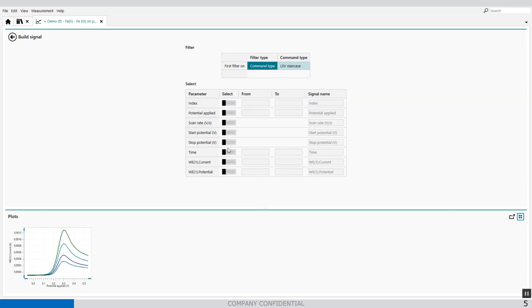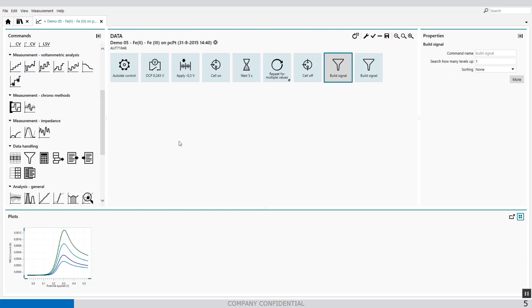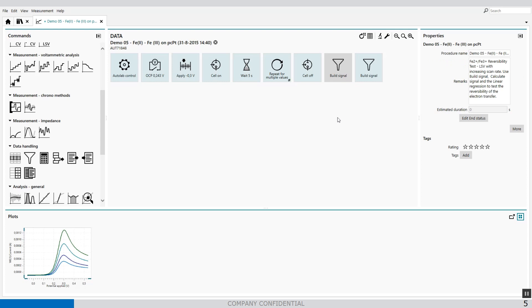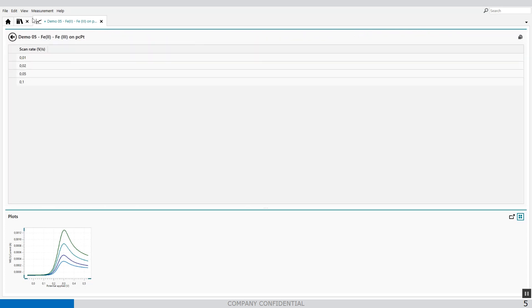We will find the scan rate. We enable the scan rate, and when I go back, I can look at my data grid to show the data. So I've extracted the scan rate.